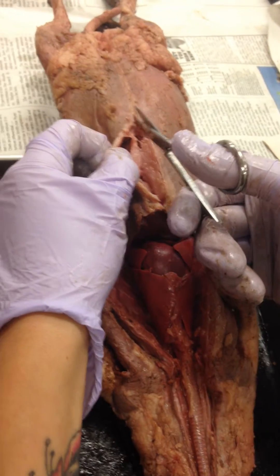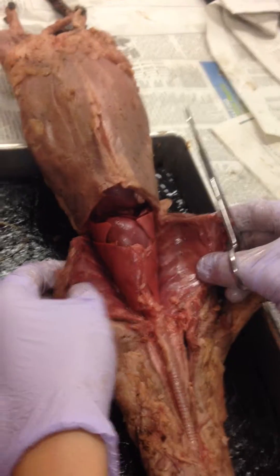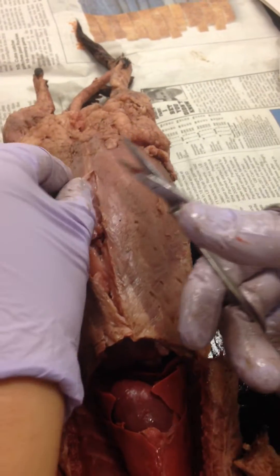Now that I'm past the fat, you'll notice — remember how thick it was up here with all that muscle, layers of muscle, and ribs? This is so skinny. Do you see in comparison how skinny that is?